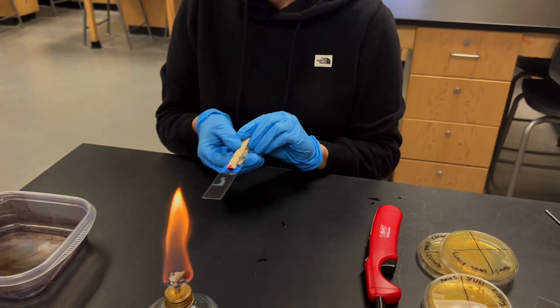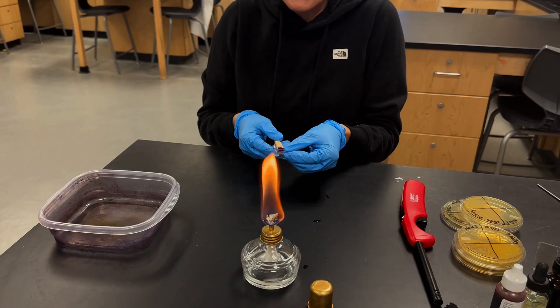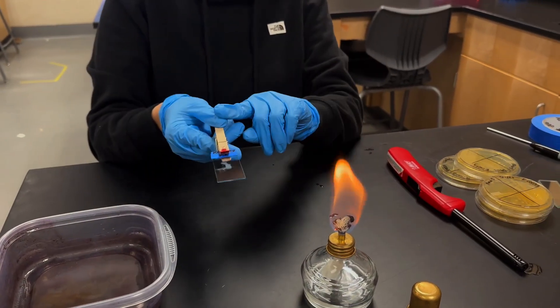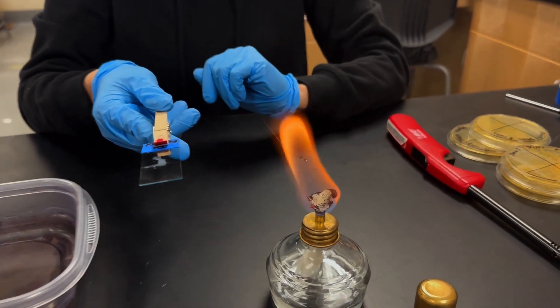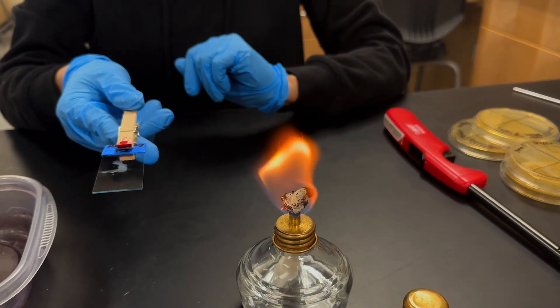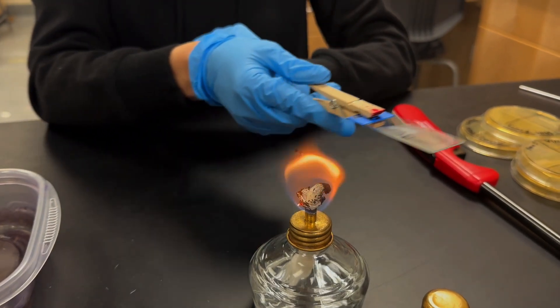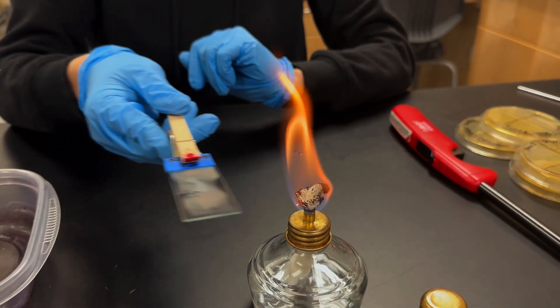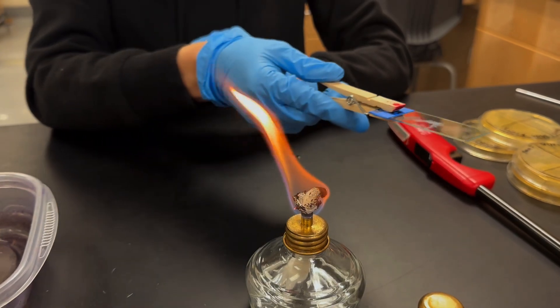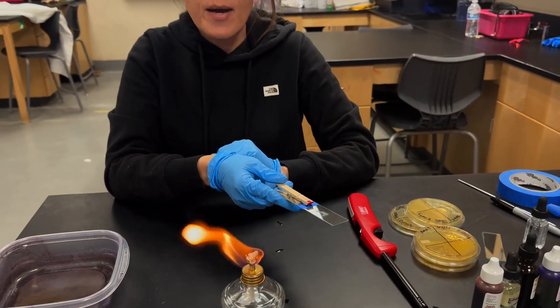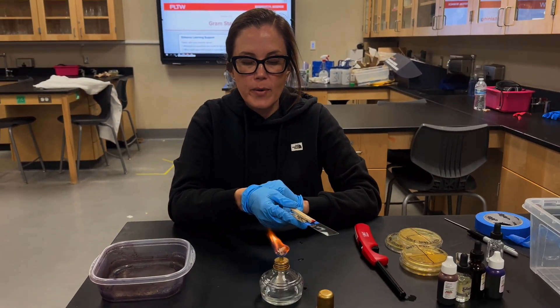And so we're going to do the fixation step of Gram staining now. And the way that we'll do that is just to run the slide through the flame three times. So we're passing it through three times. You don't want to hold it in the flame at any point. You just run it through three times. So we'll go like this one, two, and three being careful not to burn your label. If you have your label on and we don't want to hold it over the flame. That's important as well.